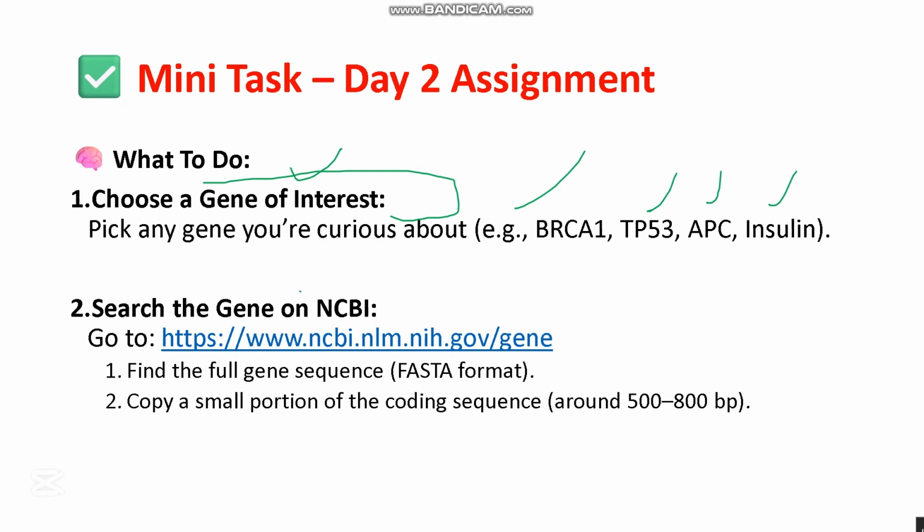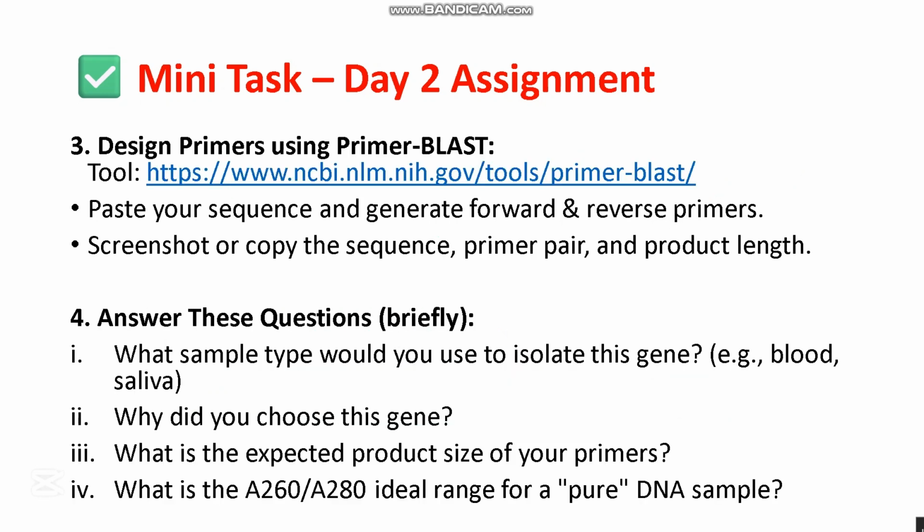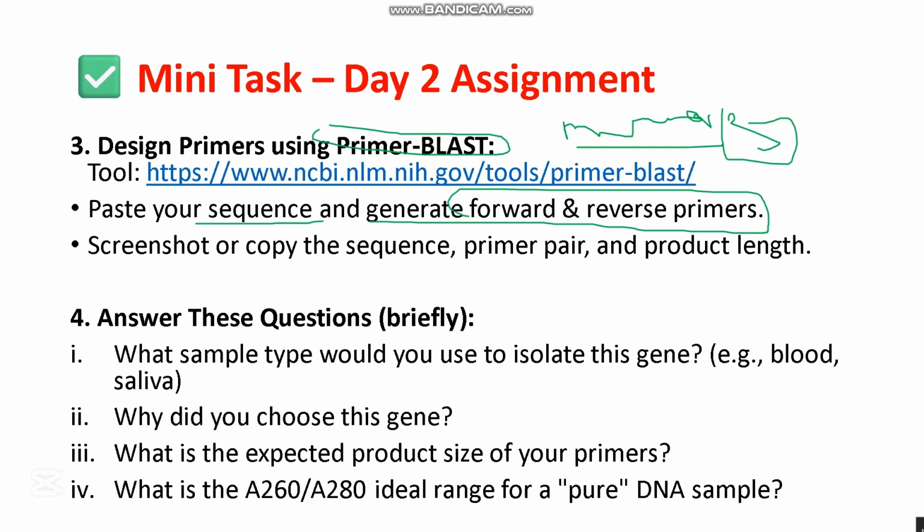Search the gene on NCBI. Use NCBI and find the full gene sequence, like the FASTA sequence, as in the hands-on practice. Copy a small portion of the coding sequence, around 500 to 800 base pairs. Third, design primers using Primer-BLAST. Use Primer3, paste your sequence, and generate forward and reverse primers. Kindly screenshot or copy the sequence, primer pair, and product size.